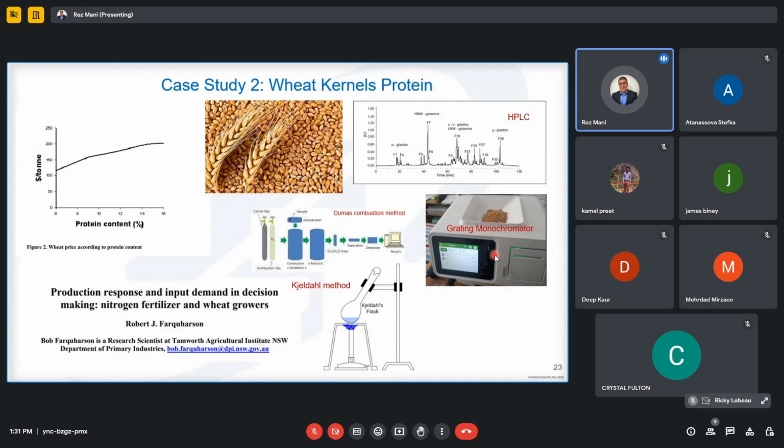But the idea was whether we could use this as a gold standard and use the near IR to do the measurements, and that would reduce the cost of the measurement, because our standard spectrometer is nearly about $2,600. And if you have a model that works, then it would reduce the cost, and then the farmers could purchase that.